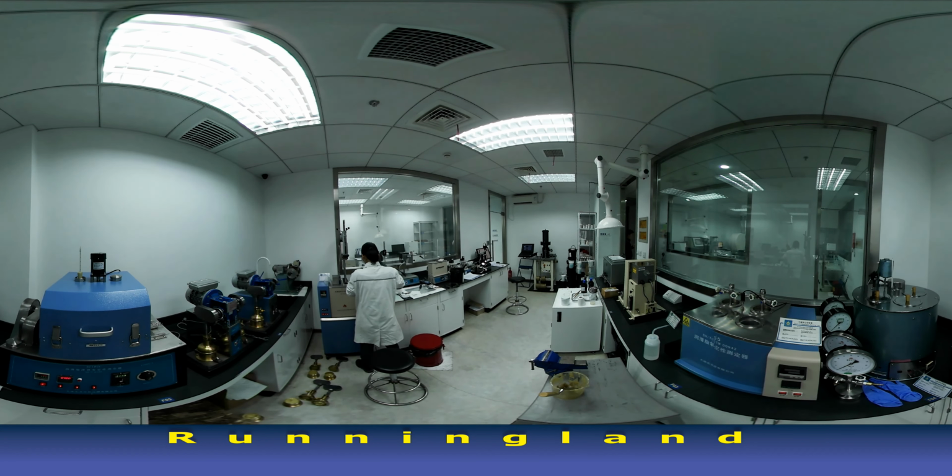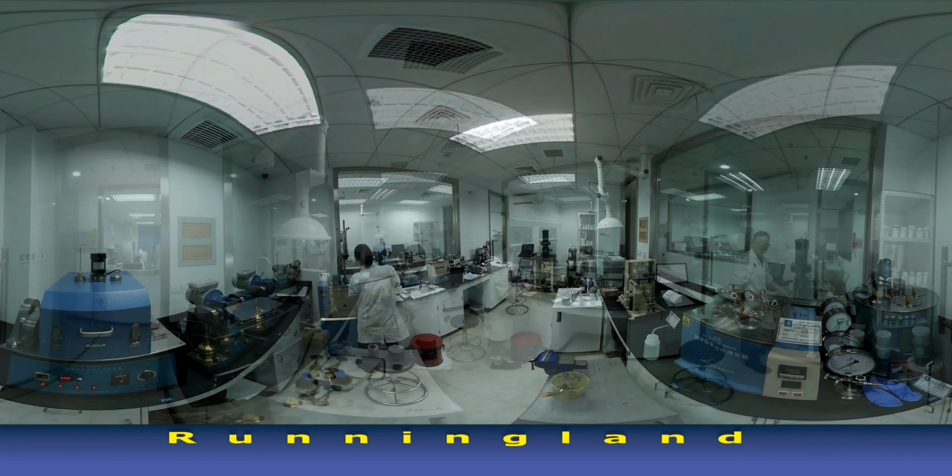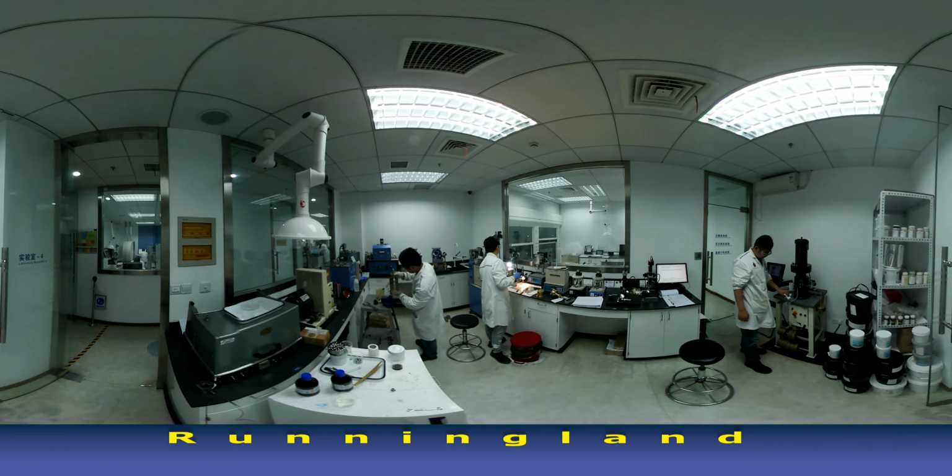Now, if you direct your eyes carefully to the other room, this is where our calibration labs are, which is used for calibrating thermometers, pressure gauges, and capillary viscometers. In order to enter that room, special access and a password is required based on staff certifications. If a staff member does not have a certification for calibration, he or she is not allowed in that room.